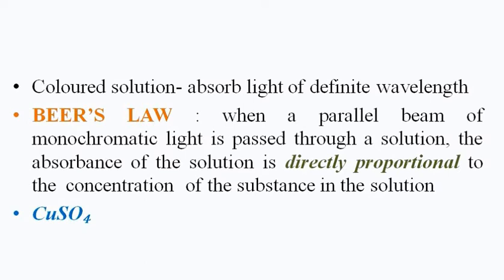When it is passed through a solution, the absorbance of the solution, what do you mean by absorbance? It measures the capacity of a substance to absorb light of a specified wavelength, of the single wavelength that we are going to use. So the capacity to absorb the wavelength is the absorbance. That absorbance of the solution is directly proportional to the concentration of the substance in the solution.